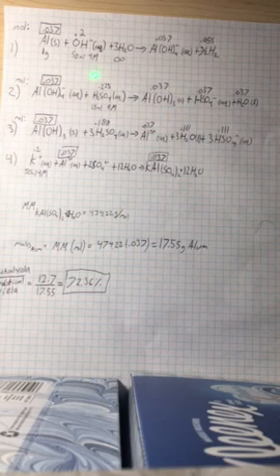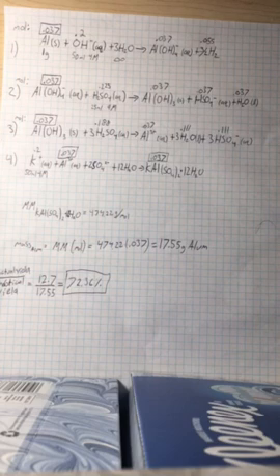And then when we put that into the second equation, it also is the limiting reactant when it reacts with sulfuric acid, which produces 0.037 moles of aluminum hydroxide precipitate. In the third equation, we have 0.037 moles of aluminum hydroxide precipitate from the second equation, which is then reacted with the remaining sulfuric acid from the second equation, which yields 0.037 moles of aluminum ions.